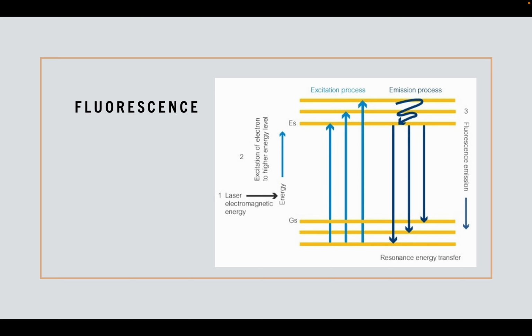So what is fluorescence? If you know this diagram, this is the Jablonski diagram. According to this, suppose a molecule is in the ground state, which is of the lowest energy possible at the steady state in equilibrium. When electromagnetic light of higher energy comes, it gains photons and gets excited to the excited state. At this state it has tons of energy, but because of that, it is not in the steady state. It is in a non-equilibrium state.